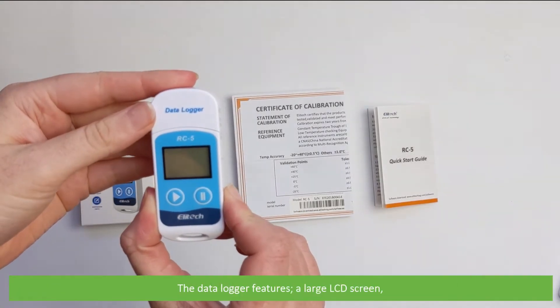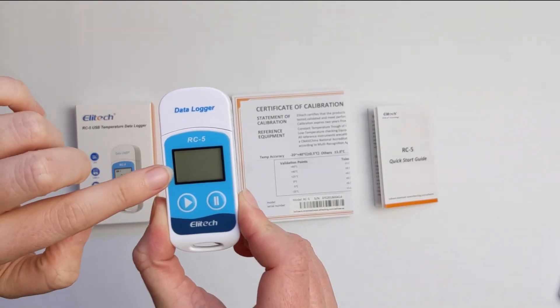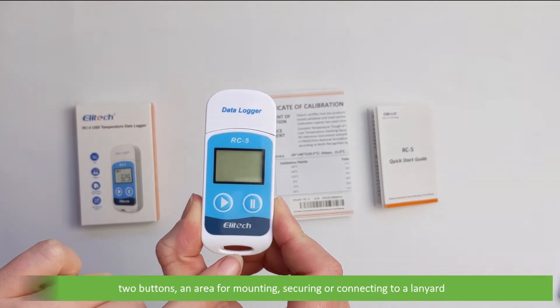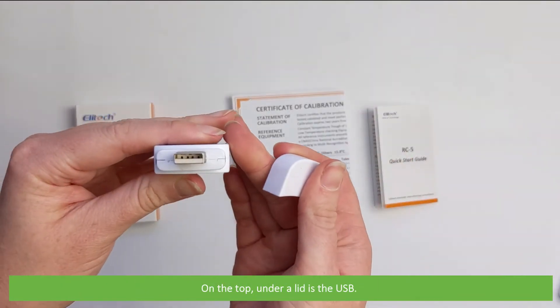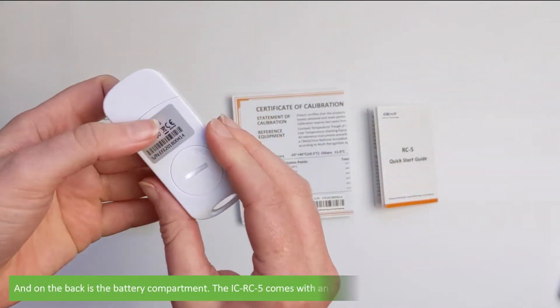The data logger features a large LCD screen, two buttons, an area for mounting, securing, or connecting to a lanyard. On the top under a lid is the USB, and on the back is the battery compartment.